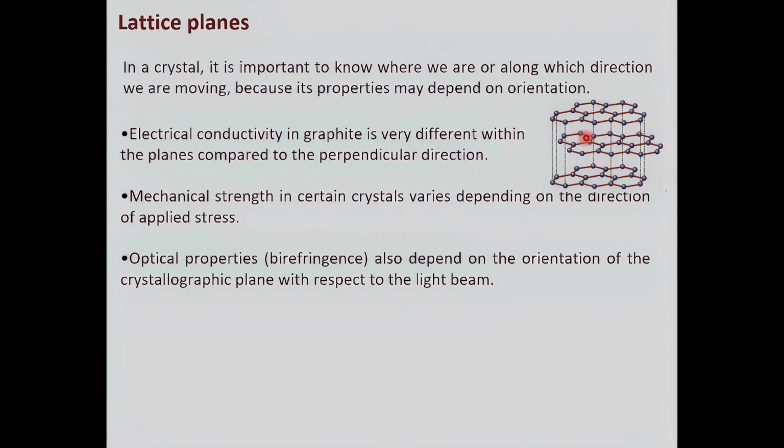And for example, the electrical conductivity in graphite is very different if you are moving along the plane or perpendicular to it. And in the same way, for example, mechanical stress depends on the direction in which you are applying the stress, and the material responds in a different way.